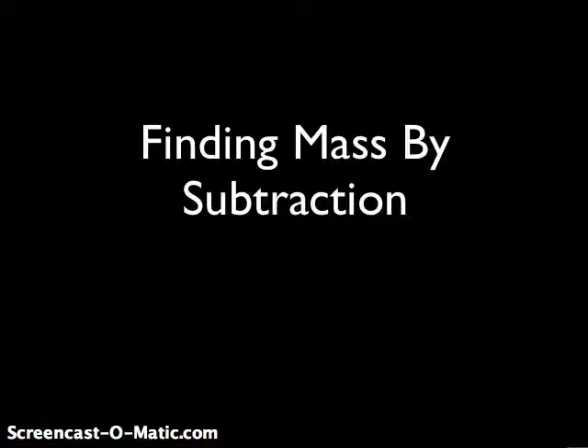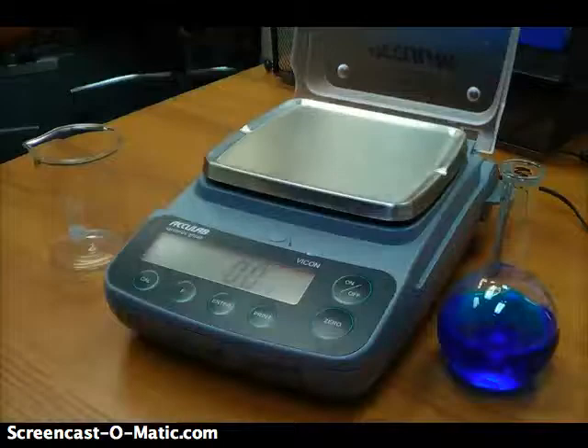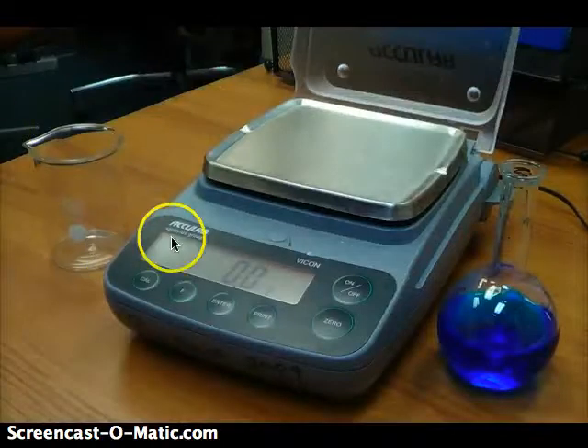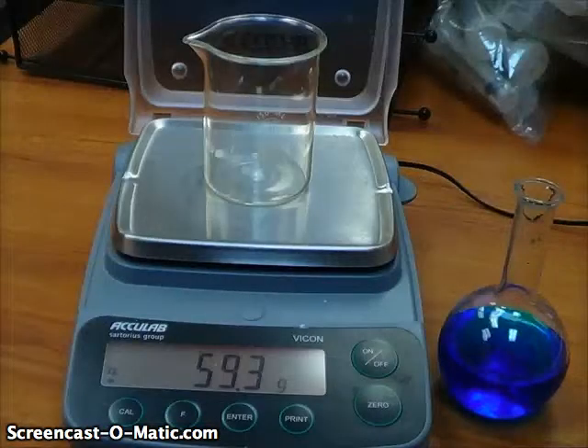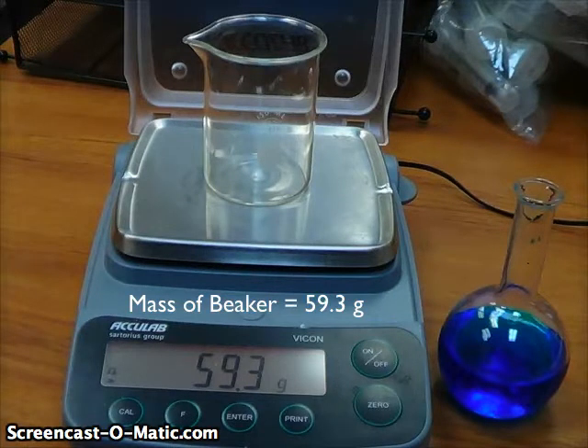The first way is finding the mass by subtraction. The big idea is we are going to find the mass of the container, then the mass of the container and the liquid, and do some math from there. I need another container to pour the liquid into — you can see I've got this beaker over here. Before I put the liquid in that beaker, I'm going to get the mass of that beaker. Here we see it's 59.3 grams.